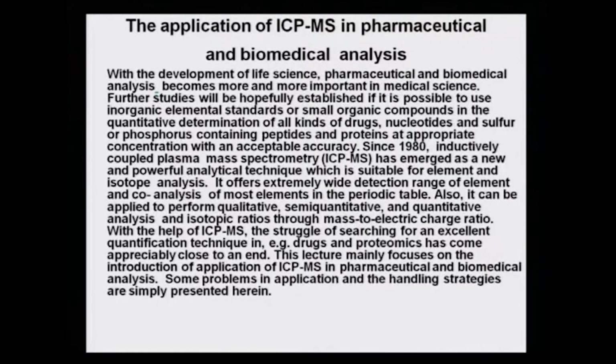Further studies will be hopefully established if it is possible to use inorganic elemental standards or small organic compounds in the inorganic standards and quantitatively be able to determine all the kinds of drugs, nucleotides and sulfur or phosphorus containing peptides and proteins at appropriate concentrations with an acceptable accuracy. Since 1980, inductively coupled plasma mass spectrometry, that is ICP-MS, has emerged as a new and powerful analytical technique which is suitable for elements and isotope analysis.